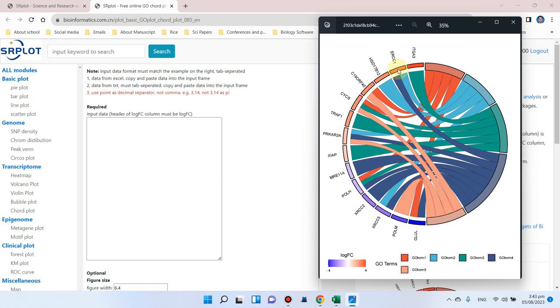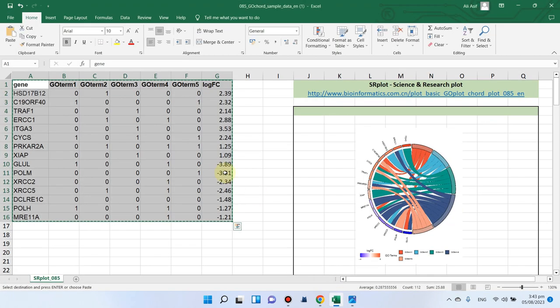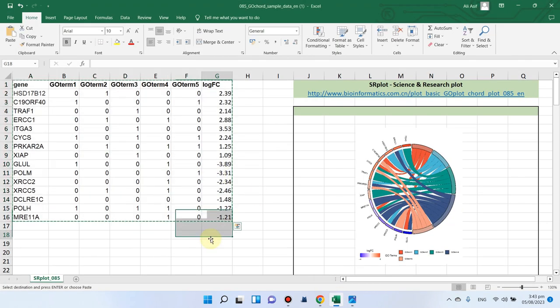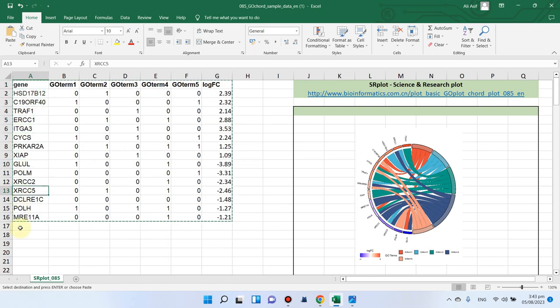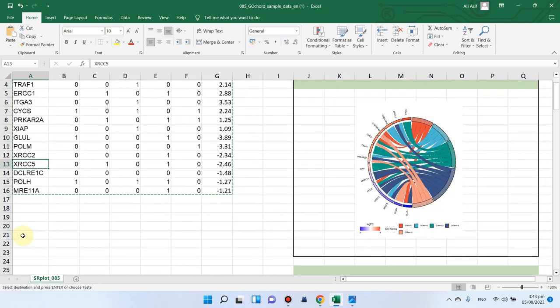Using this simple website, first of all let me show you which data you should have. Here is one example - you can see in the first column we have gene IDs, so you can also have your gene IDs up to 30.